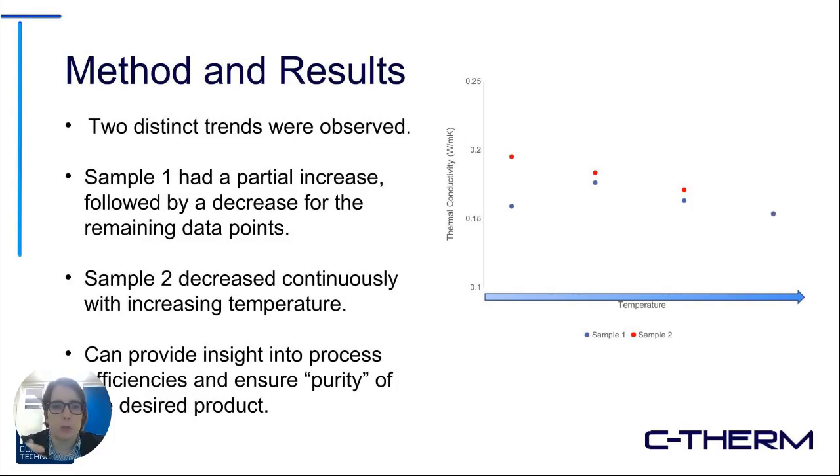This can be used to, again, model process thermal management, but it can also provide insight into the process efficiency and perhaps the purity of the end product.